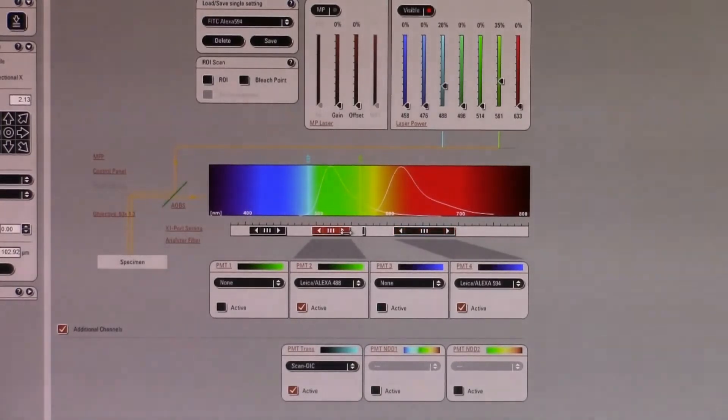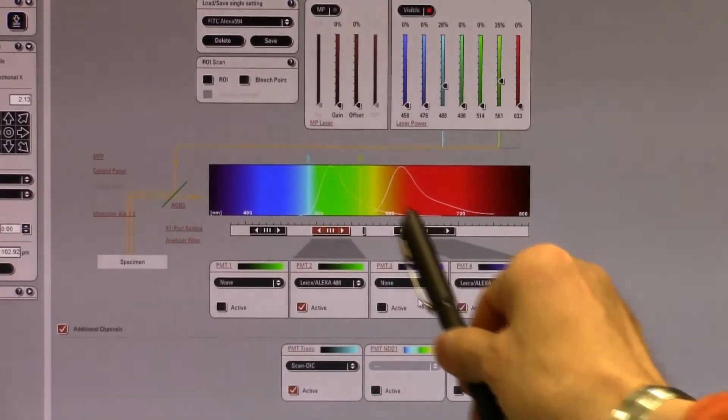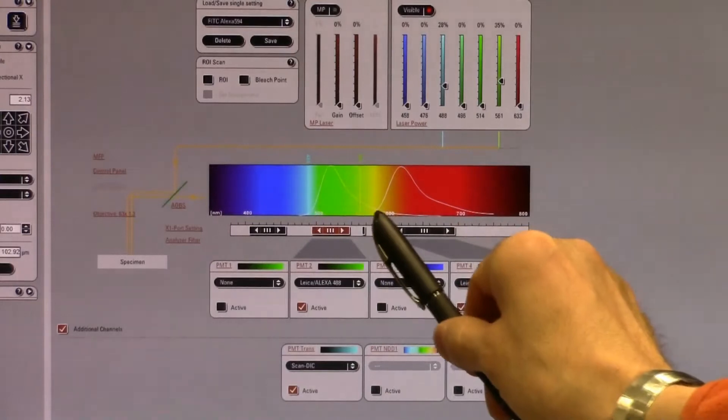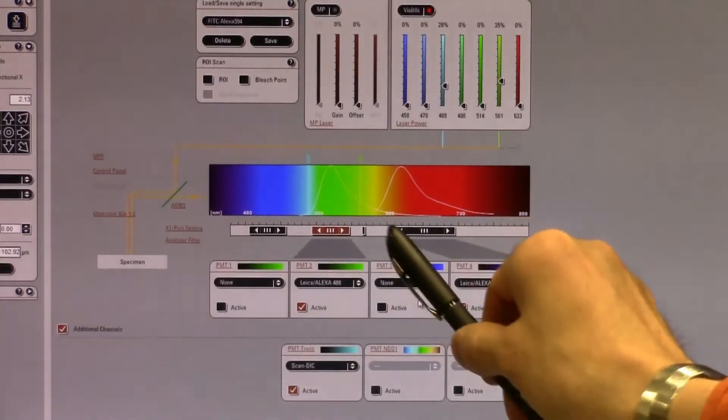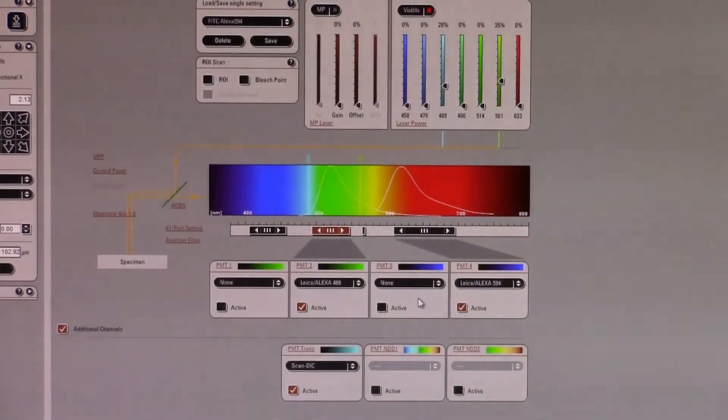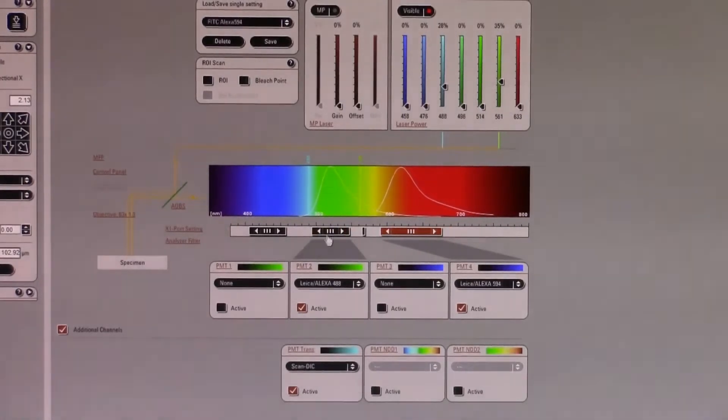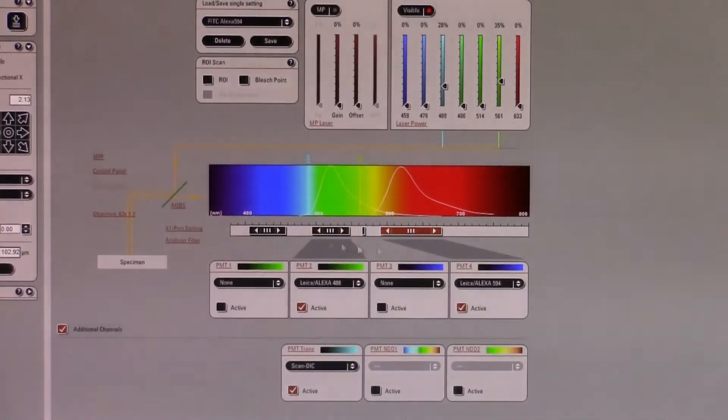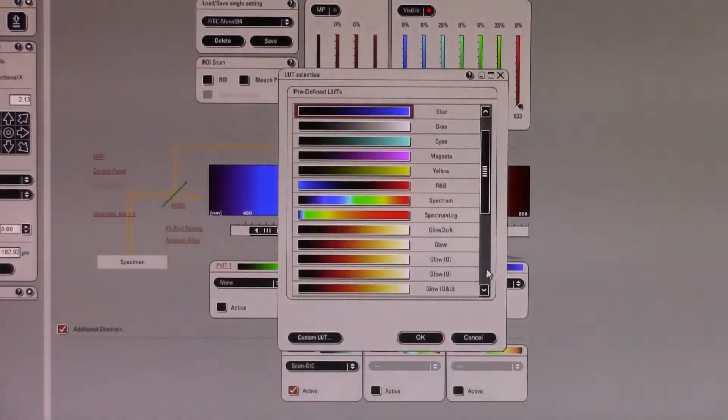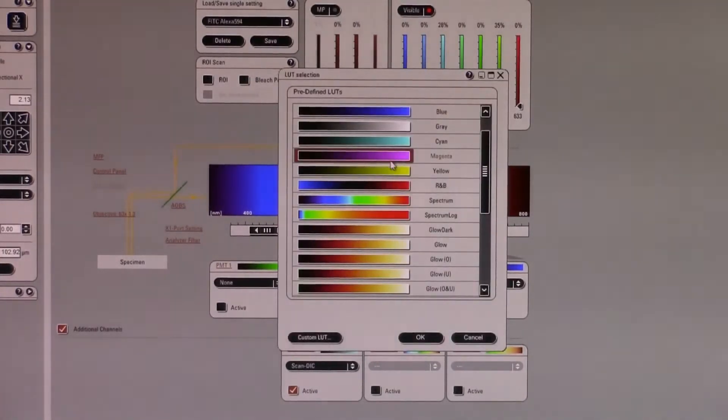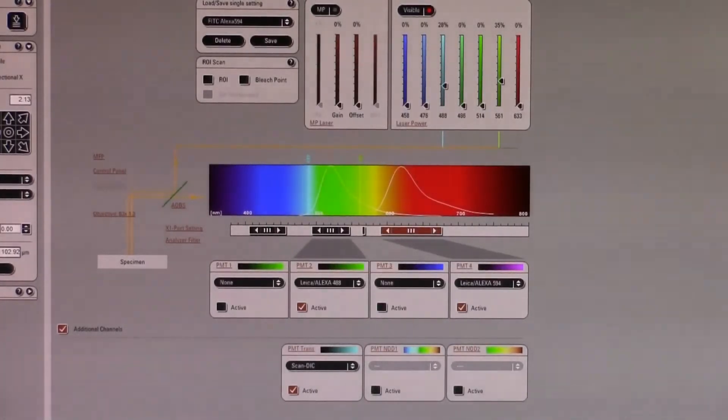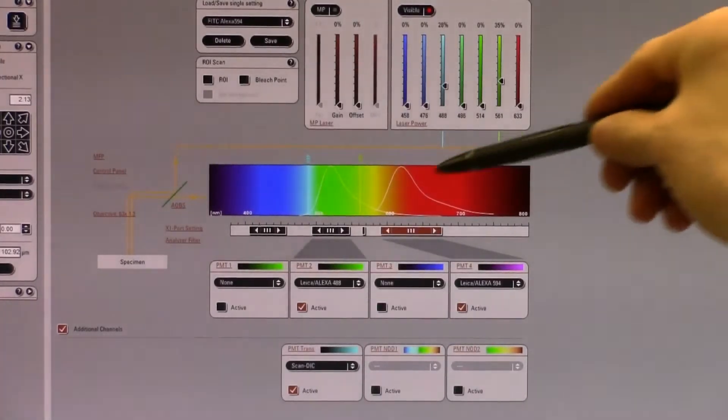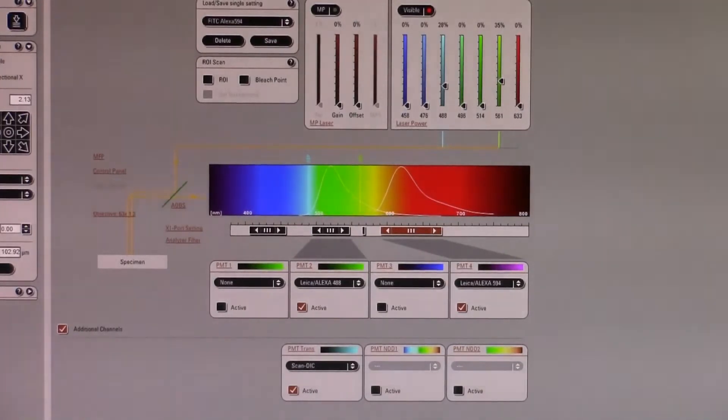Depending on the fluorophores, we want to make sure that our gate is not too close to the spectral overlap between two potential fluorophores so that we can have a distinct signal. I'm going to set these two gates approximately at these widths to start with. PMT 4 has not the right color, so I'm going to change that to magenta, and the two PMTs are active.